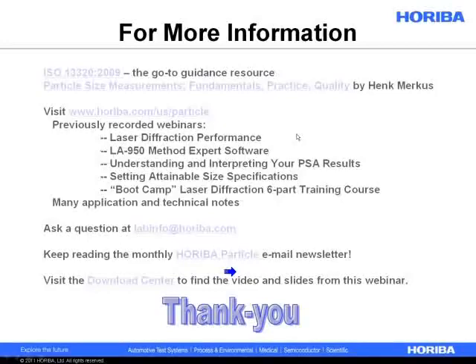But I keep giving long answers to simple questions. Let me give a short answer to this question. If it's stable at multiple concentrations, it doesn't really matter. It's your personal preference. If it's not stable at multiple concentrations, then you have an option to measure with diffraction, in which case you should try and measure as fast as possible, because what's going to happen is it's going to coalesce and the size is going to change over time. So you want to measure as fast as possible so that it doesn't have that much opportunity to change or coalesce.